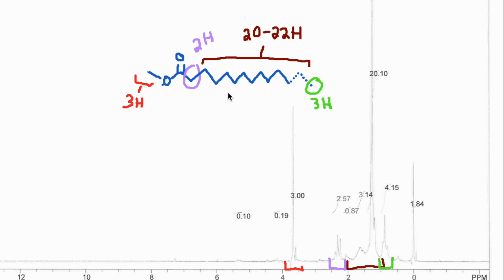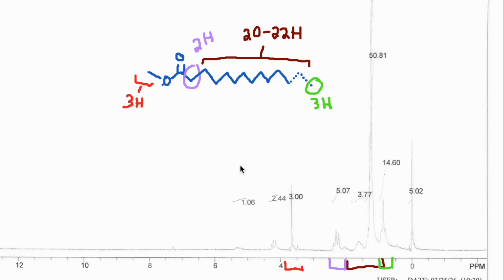And then we have a total of about 25 to 27 alkane protons that are not in the 4 ppm region, maybe 2 that are close to 2 ppm. So over here we have about 2, a little bit more than that, maybe 3 or something down lower, and then about 20-ish in the middle here. If you add this 3 and this 20, we have about 25. So not a lot of extra alkyl protons from contaminants.